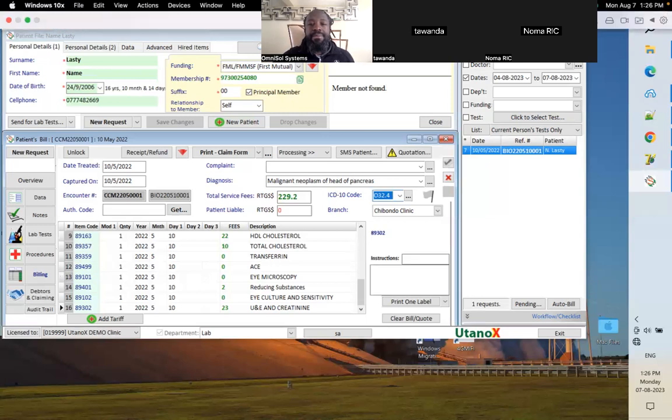Okay, all the system requirements, you said you want us to have a server, which is a desktop with 8 gig, core i5 or above. What if we don't have 8 gig at the moment, but we have a core i5? Okay, so when you're starting, because you still have a low volume of data, you can get away with just 4 gig, but definitely not lower than 4 gig. However, we want you to have a plan to make sure that within about 3 months, you have something with at least 8 gig.